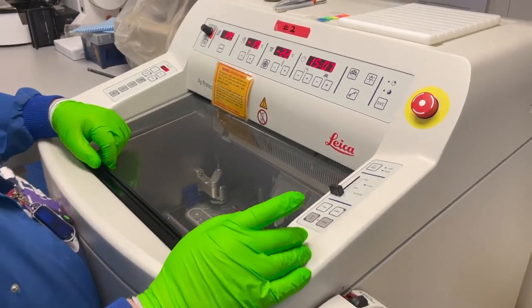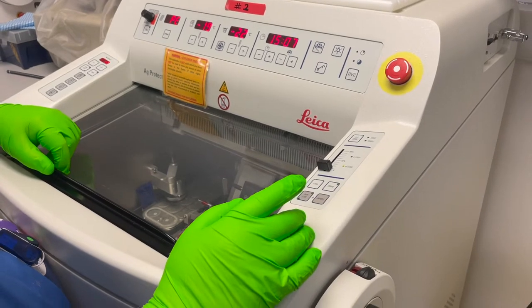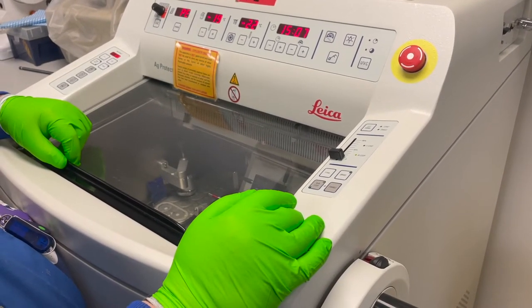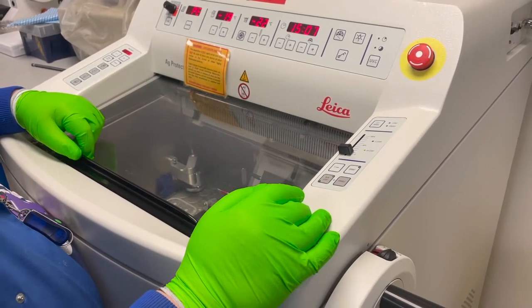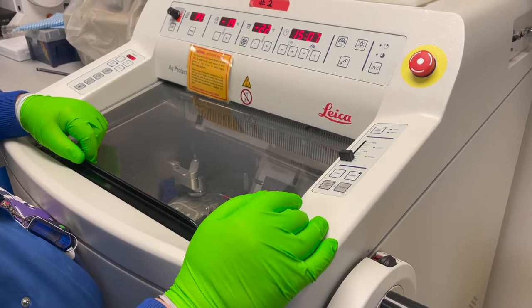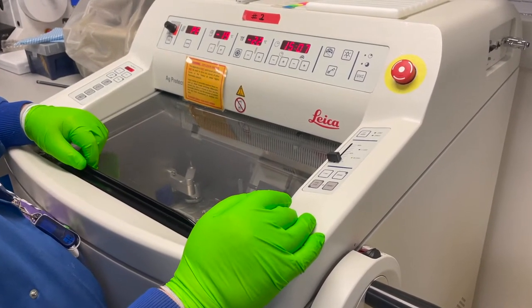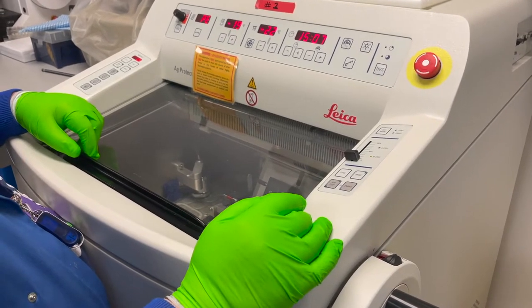This is a Leica CM1950 cryostat. It's a clinical grade, top of the range machine. We have a suite of them within the core facility. It has additional safety features that are above the standard research grade cryostat.